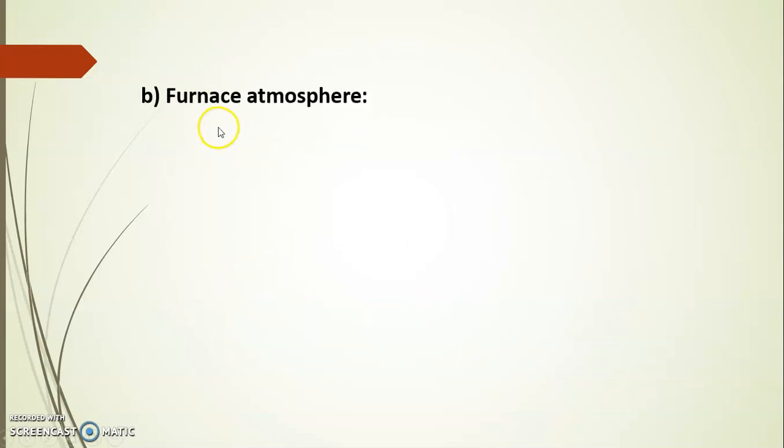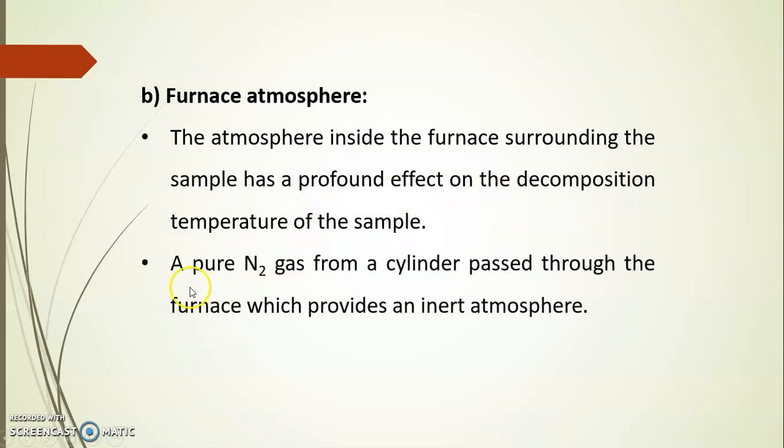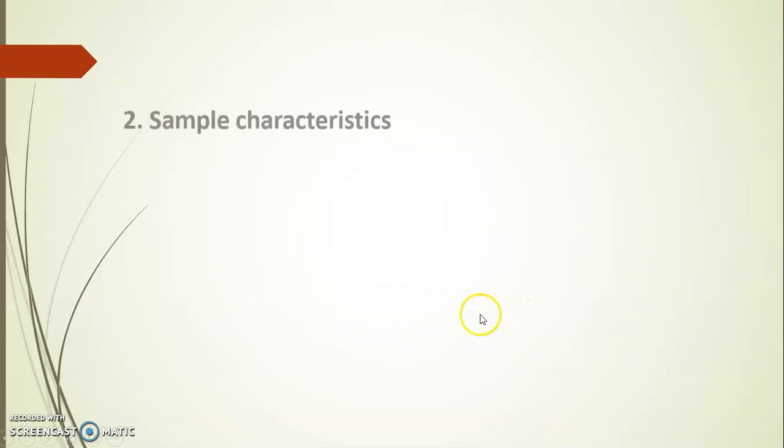Second sub-factor is furnace atmosphere. The atmosphere inside the furnace surrounding the sample has a profound effect on the decomposition temperature of the sample. Pure nitrogen gas from a cylinder passes through the furnace, which provides an inert atmosphere.